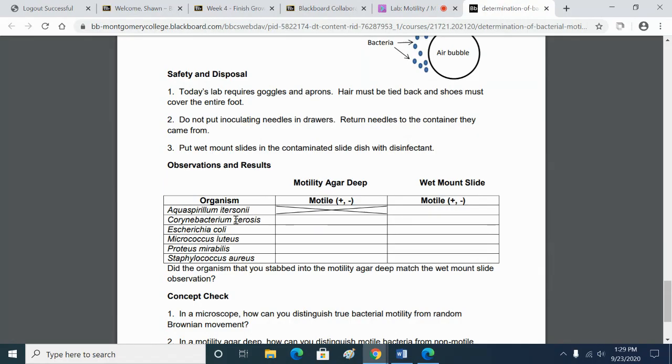No, because it's in a cluster. So again, usually bacteria that are clustered are not going to be motile because it's just too hard to coordinate the movement. I'm not saying there are not any cluster bacteria that are motile, it's just that it's not common for bacteria stuck to each other to be motile.